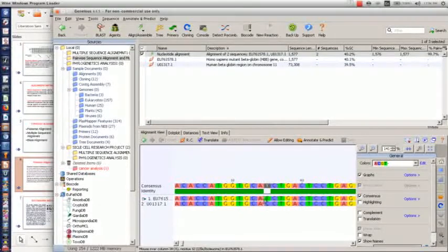So that means a mutation has taken place here, and we understand that there are three types of mutations: deletion, substitution, and addition. Now in this area, in the mutant sequence we have T, so this is telling us that T has been put in place of C in the mutant sequence.